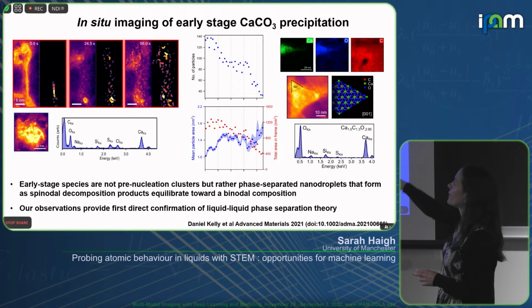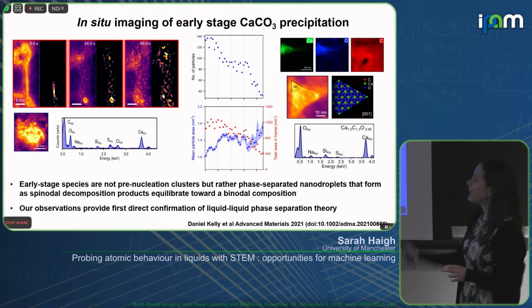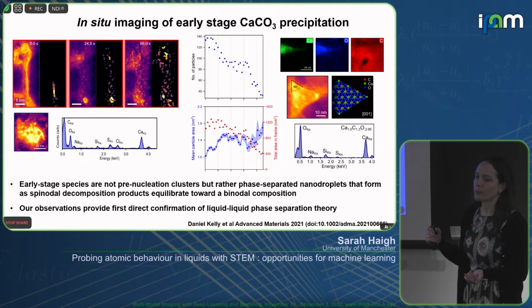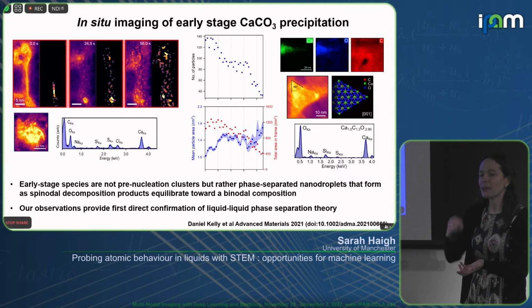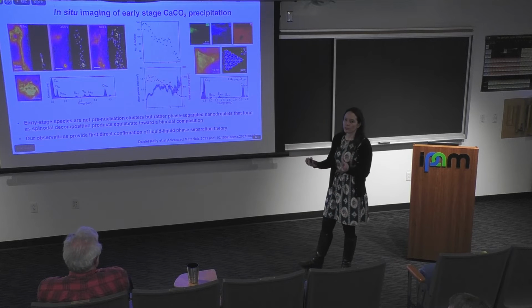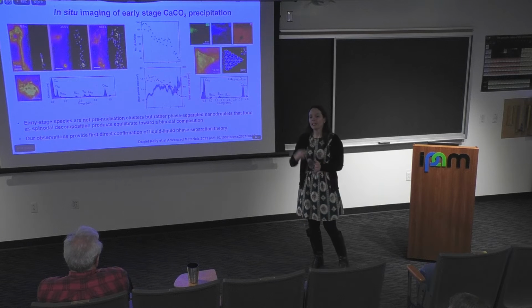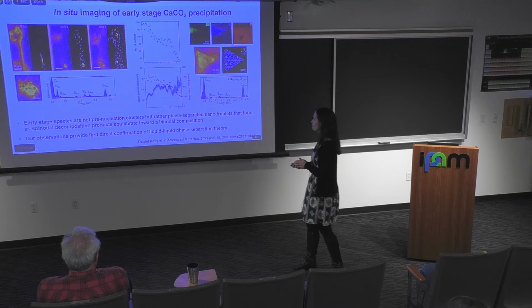in order to form what you would recognize as being a calcium carbonate crystal, these facets tell you it's a nice single crystal. In order to form that, you have to turn the electron beam off and do the reaction with the electron beam off. So you break or pierce the membrane, allow the liquids to mix, and now you do the snapshot approach. So you look at it after 5 seconds, after 10 seconds, after 15 seconds. If you just keep looking at it, you never go beyond these nano-sized clusters, which we assume is due to dehydration. We would love to be able to use lower electron doses and interpret the images in a similar way. Again, opportunities there for machine learning.